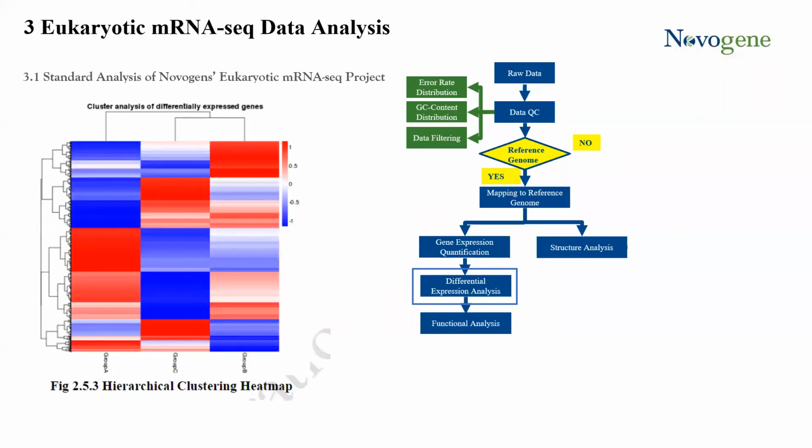The volcano plot is followed by the cluster analysis of differentially expressed genes. This graph indicates genes with similar expression patterns under various experimental conditions. By clustering genes with similar expression patterns, it is possible for you to predict unknown functions of previously characterized genes, or even to have an insight into possible functions of unknown genes.